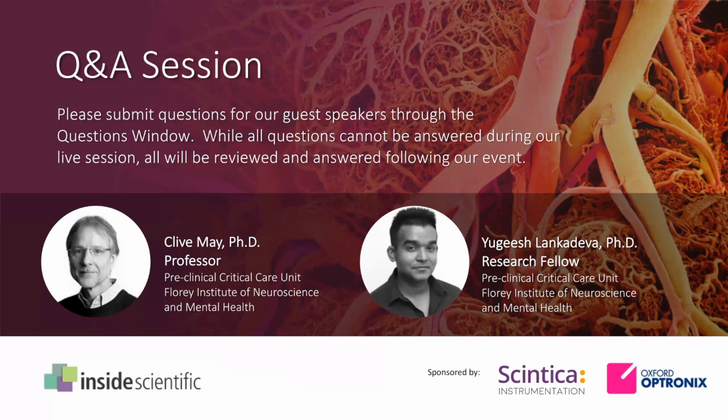Okay, great. Michael, how are the long-term sensors calibrated to ensure continued accurate measurements of tissue oxygenation? Right, that's a good question. We calibrate each sensor individually against a range of 6 nitrogen-oxygen mixtures between 0 and, if I remember right, 21% oxygen. That data is converted into a calibration curve for that individual sensor and is stored inside a little microchip in the connector for that sensor, which is read by the monitor once the sensor is connected.